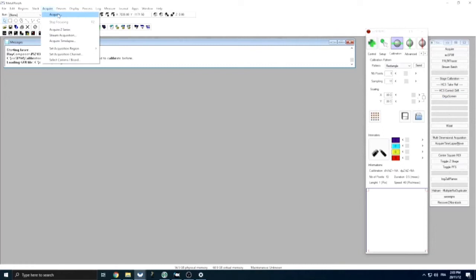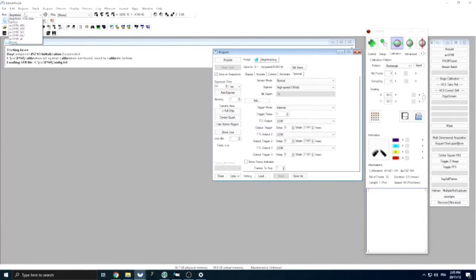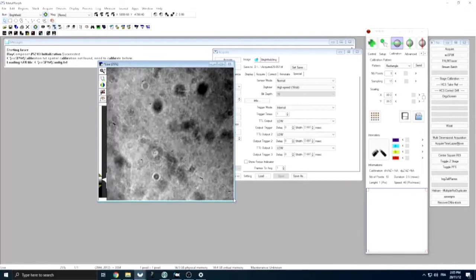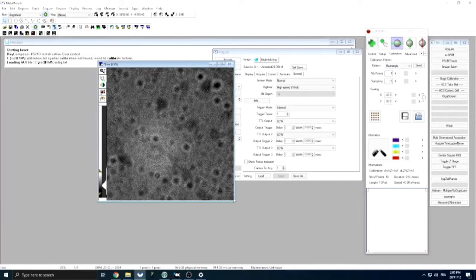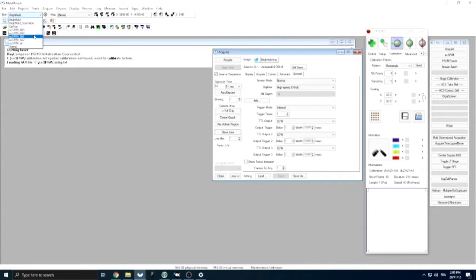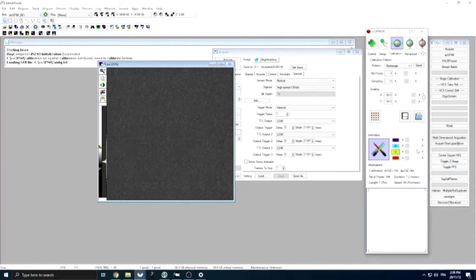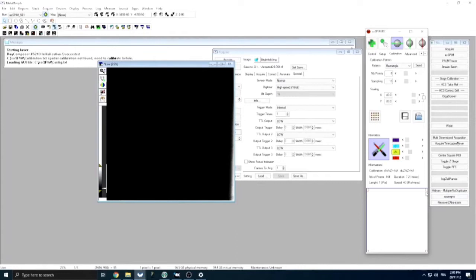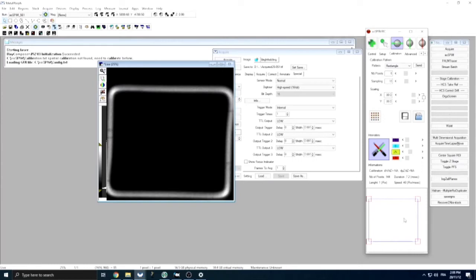For this calibration, we first have to focalize our image plane onto the fluorescent layer on top of our coverslip. We open the acquisition window of Metamorph and select a brightfield illumination mode, then adjust the axial position of our objective. Once focalized on the fluorescent layer, we switch to SOSPIN illumination mode using one of our laser lines — in this case, the 561 nm channel. In the calibration tab, I select to draw a rectangle with our galvanometric mirror and then start the acquisition, raising the laser intensity to observe it on the fluorescent layer. I then have to adjust the size of this rectangle so that it fits perfectly onto the camera field of view, as the calibration will be done and valid inside this rectangle.